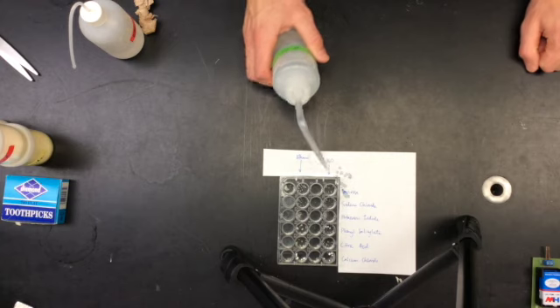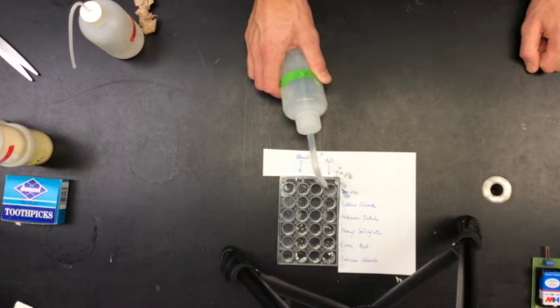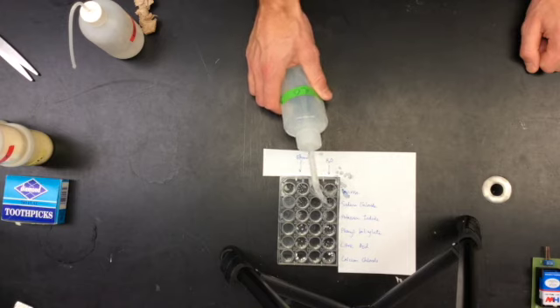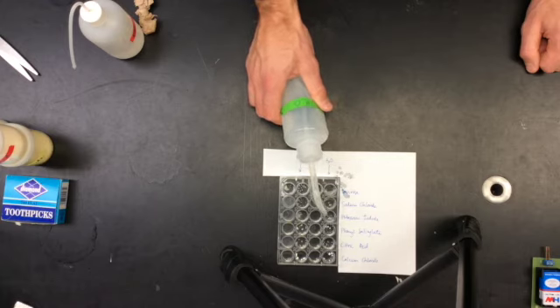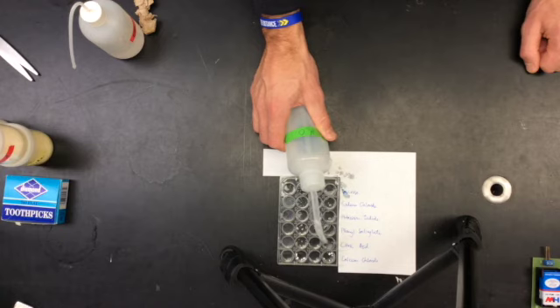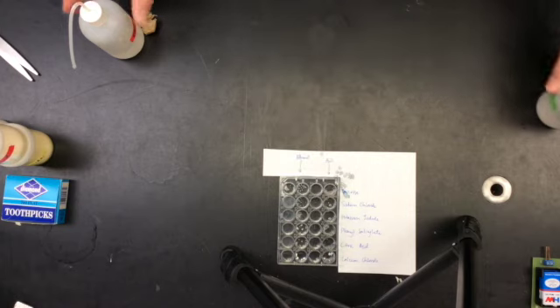To save us a little time in counting, rather than add 10 drops, I'm going to fill the well plate just cover the bottom of the well plate so we can get an idea if we're going to see these guys dissolve in water or ethanol. All right, then we're going to come back.